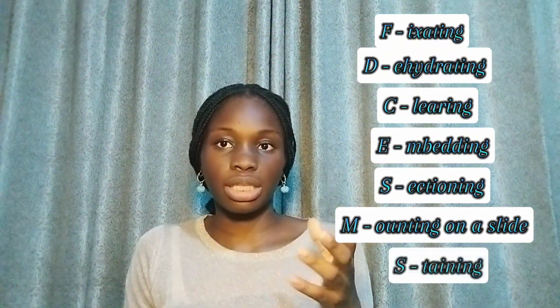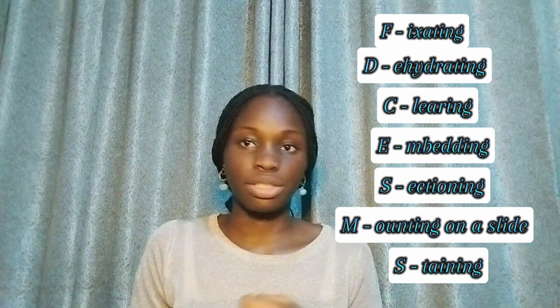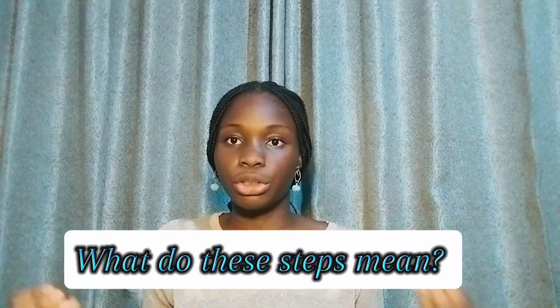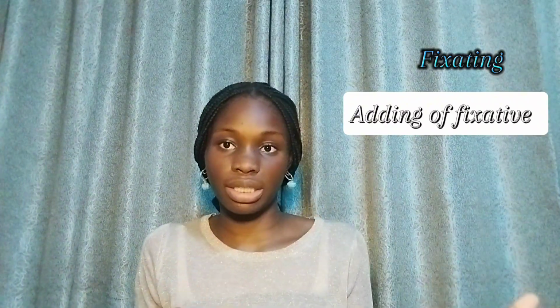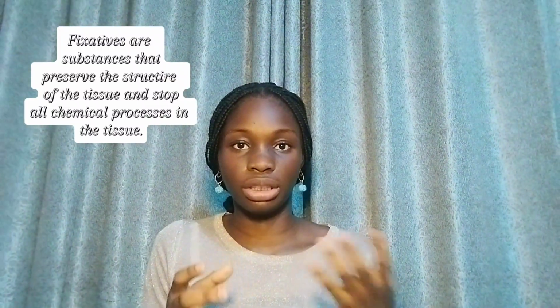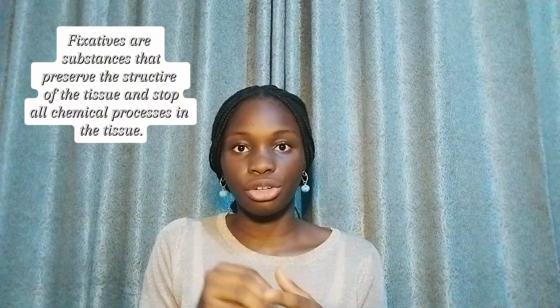But we have to understand what each of these things are, because even if somebody tells you, oh, ensure to fixate, ensure to dehydrate, ensure to clear or to embed, you can't fully grasp that until you know what that is. So when you enter the lab, what should you do? The first step we talked about was fixating, right? Fixating has to do with adding of fixatives. And what are fixatives? Fixatives are substances that preserve the structure of the tissue, and they stop all ongoing chemical processes that are occurring in the tissue.